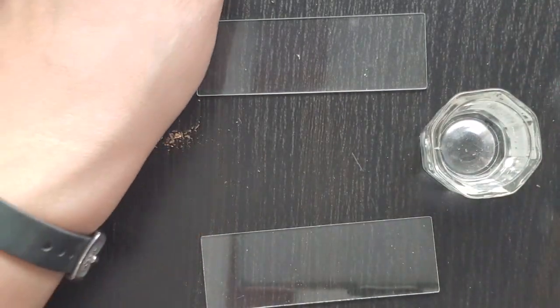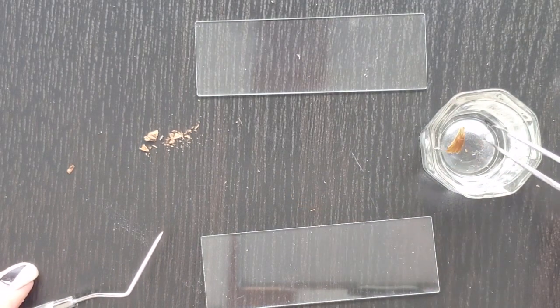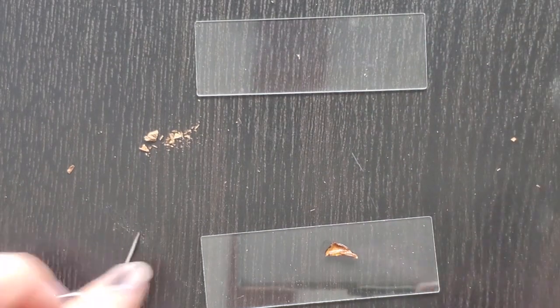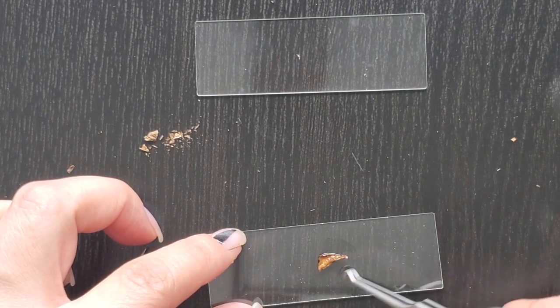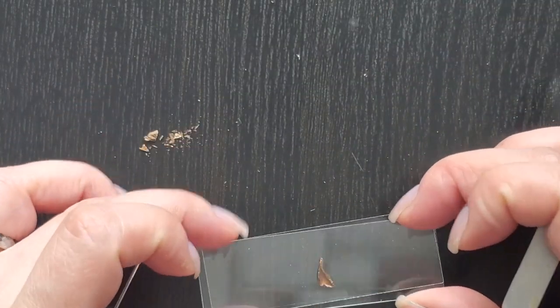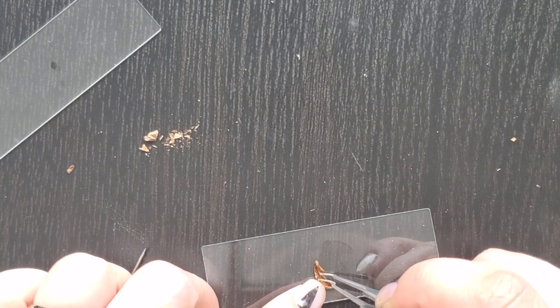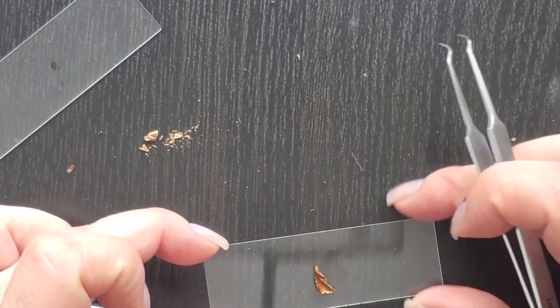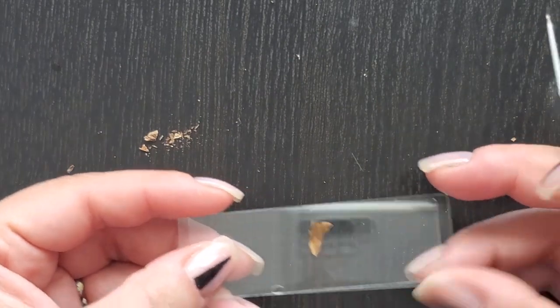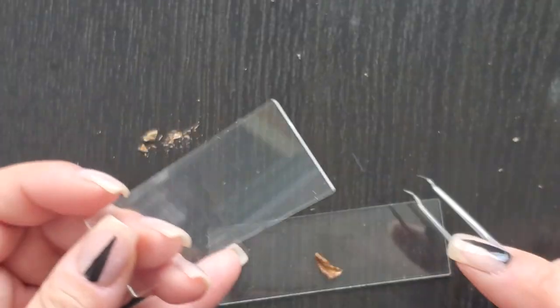I have some ethanol in here, and I'm actually just going to grab this guy, plop it in the alcohol, and take it right out. Now this one should be able to sustain pressure from my cover slide, from my glass slide. And again, I want to kind of place it so that I know what's where. It's still kind of toasty, but it's more flexible. This is just ethanol. It's 80% ethanol. There's not that much water in this mix, but just want to make sure that I have it. Yeah, so here you can see the orientation of the gills. And I'm going to try and cut anyway that way.